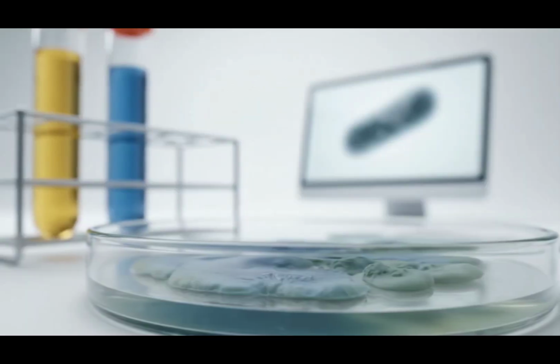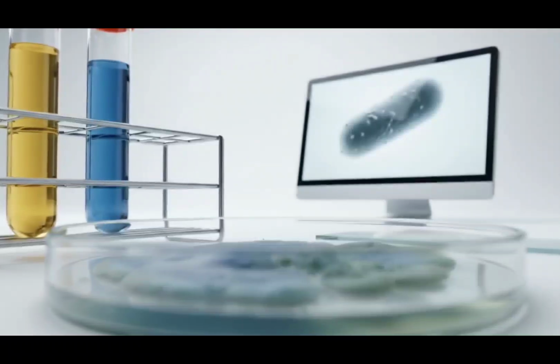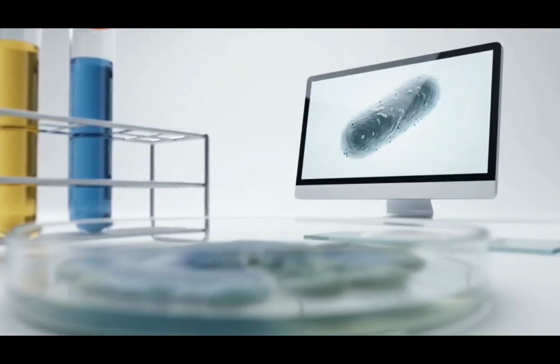By reading these metabolic pathways, you have translated an ambiguous biological sample into definitive data. You now have the exact identity of the infectious agent.